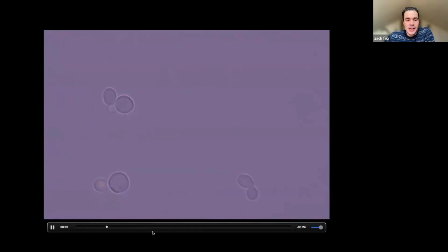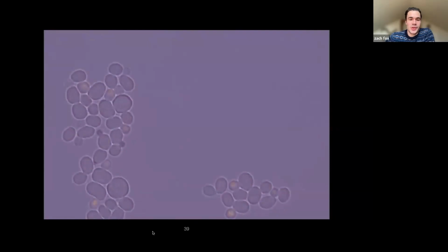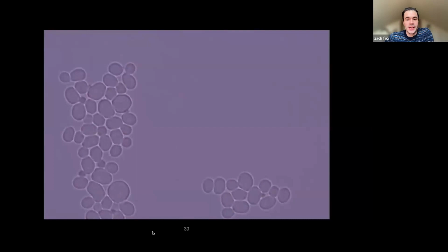You can see each cell is getting different signals. And then at some point, you'll see a big flash of all the cells, probably in a second here. Right now. And that's where the target went up. And then the algorithm is poking each cell to maintain that level.